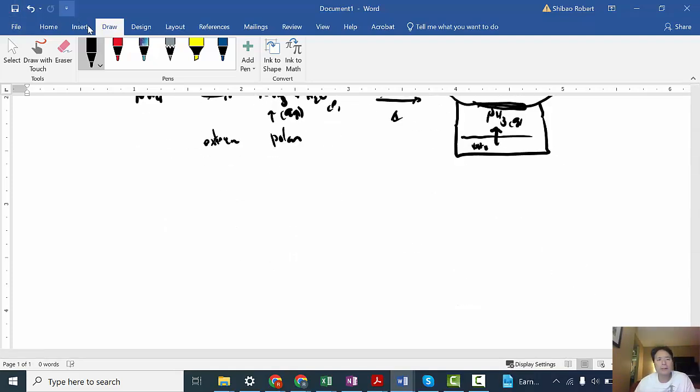And so the way we can say is the gas is going to come in contact with the wet litmus, so called just H lit here. And if I do that, then I'm going to form ammonium ion and then whatever the anion is.